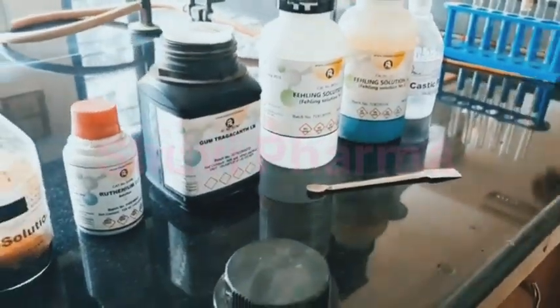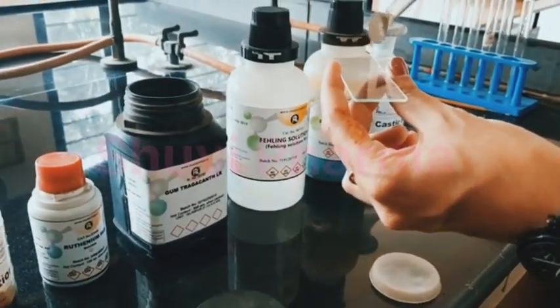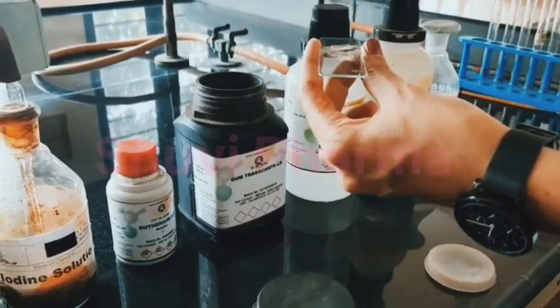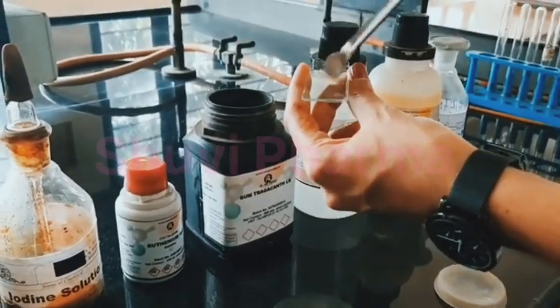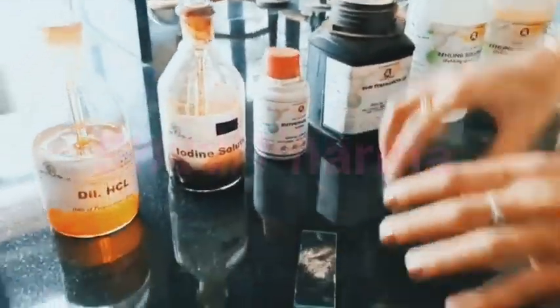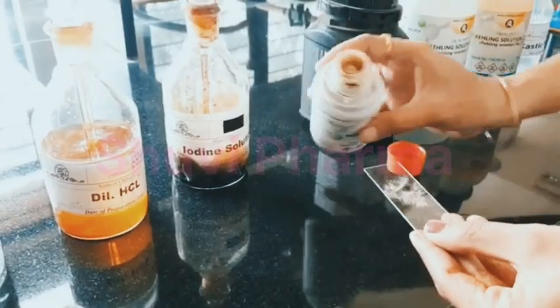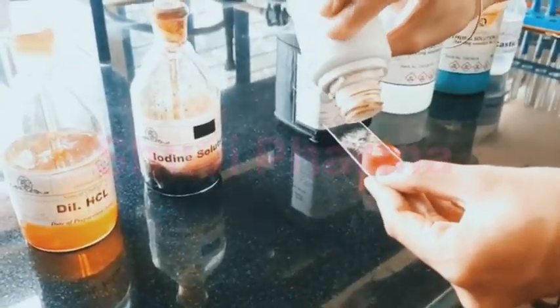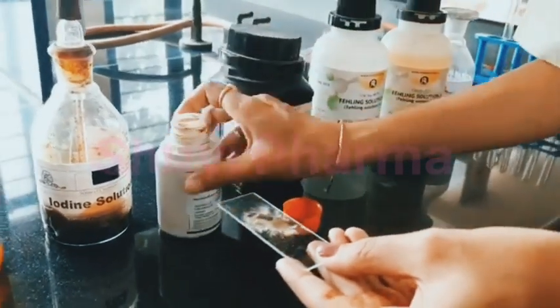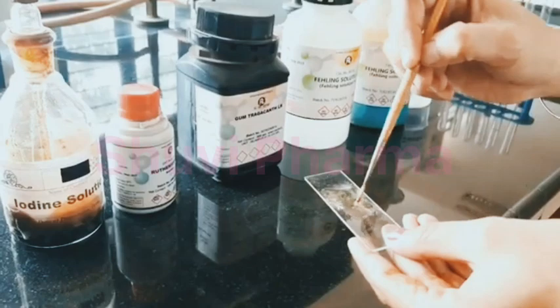Now for the next test we require a slide. Over that slide we will spread the tragacanth powder with the help of a spatula. And to this we'll add ruthenium red solution. Mix this with the help of a brush.